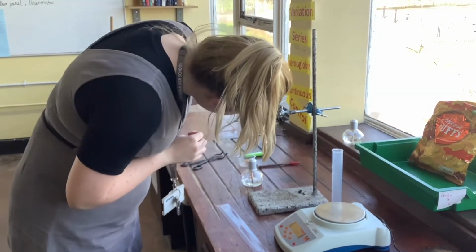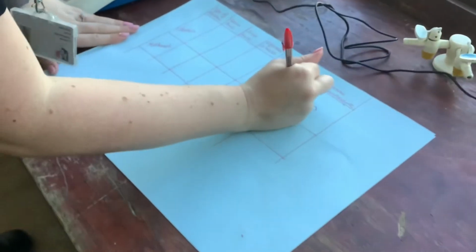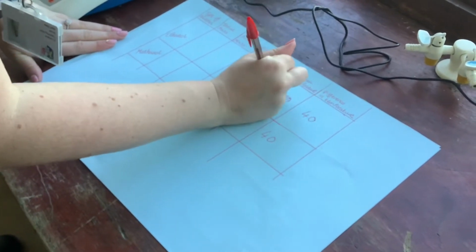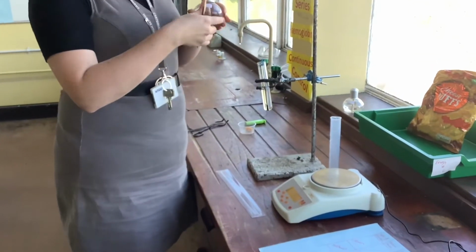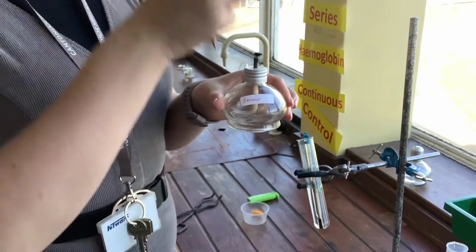So the initial temperature is bang on 20. Okay, so our initial temperature of water is 20. The next thing we're going to do is find out the initial mass of our alcohol. We're going to use the ethanol one first. Make sure you measure all of it, so the cap included.